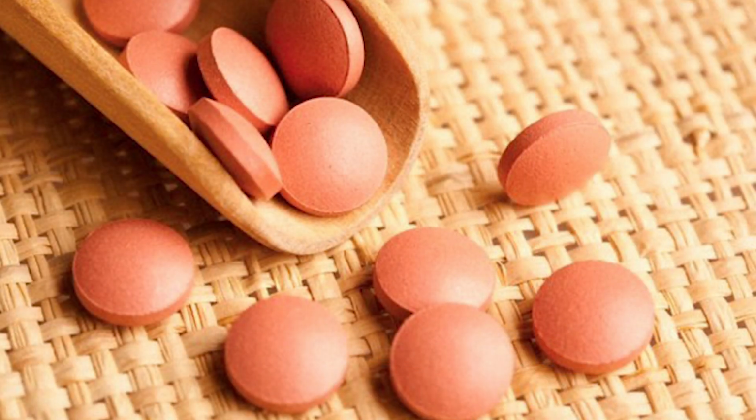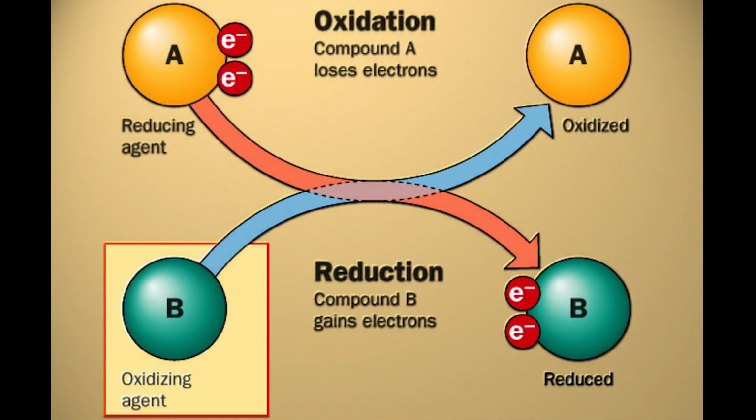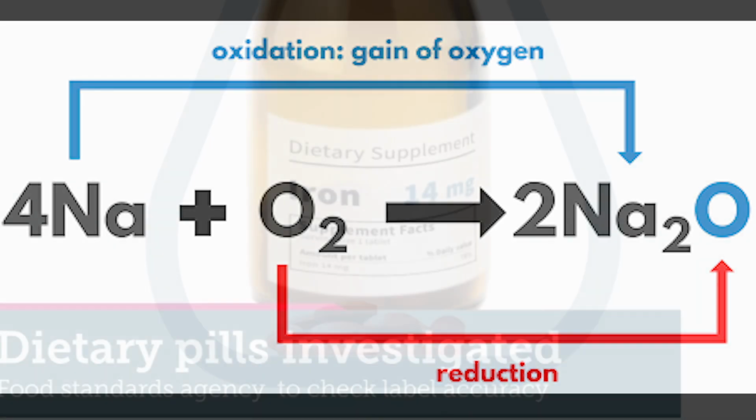Now you may be asking what that is and how it works, and to answer your question simply, a redox titration, unlike a traditional acid-base titration, measures the point at which a redox reaction is complete. This means that in a redox titration, the unknown substance is being oxidized and losing its electrons, while the known substance is being reduced and gaining electrons. Once the unknown substance has no more electrons left to give, the endpoint is reached. This will be indicated by the presence of the known substance starting to take over the solution.